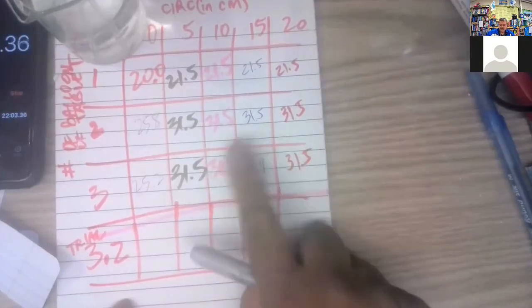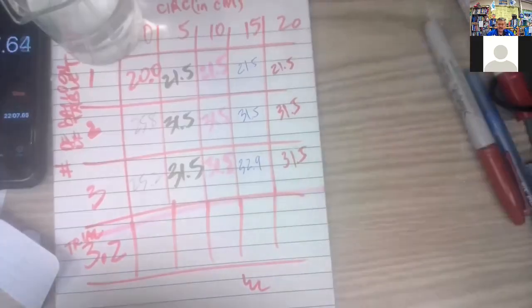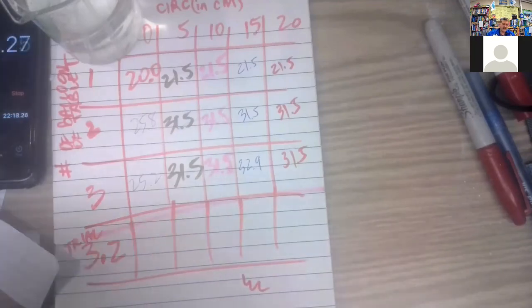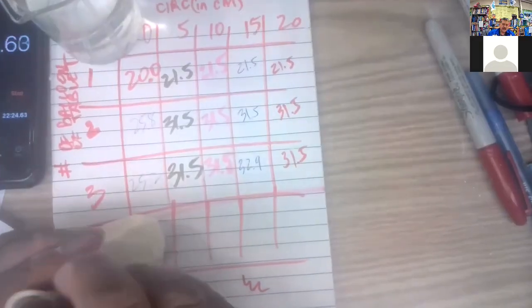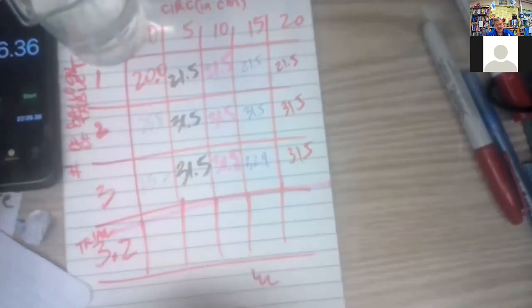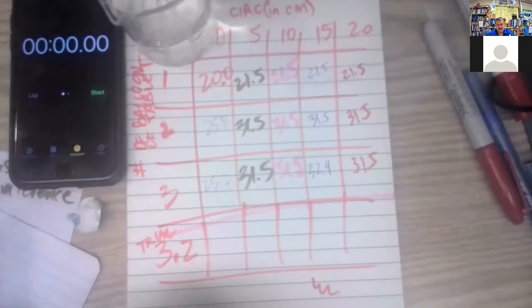That's why it was a little bit bigger. Or maybe it did get actually bigger and then it leaked out, and maybe my tie wasn't good enough, or eventually a balloon loses air, so maybe some air got left anyway. All right, so let's try this. Let's stop that, and then I will reset it at 0.